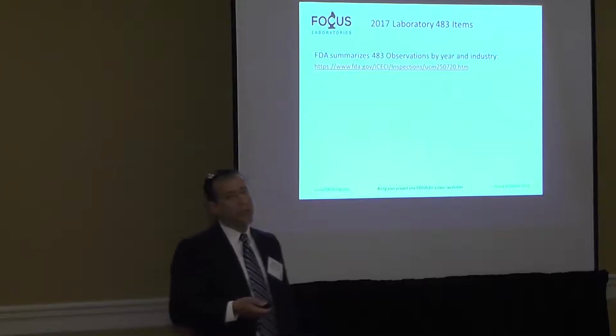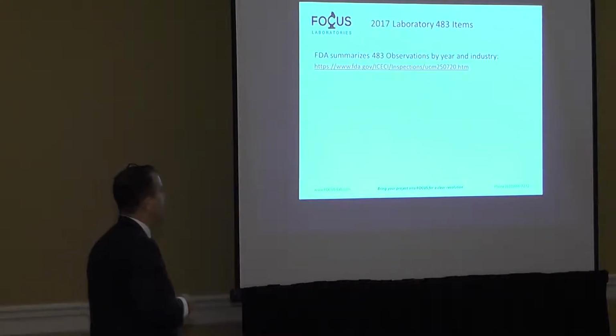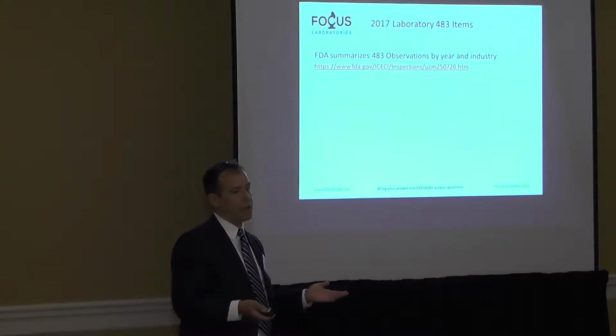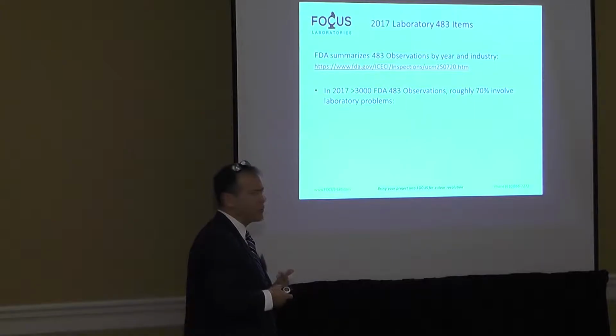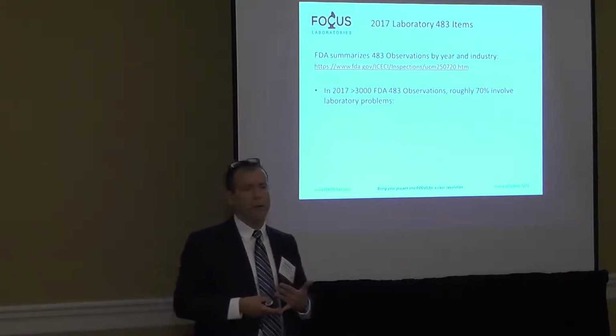In 2017 on the FDA website, there's a really interesting link. You can pull it up here. It's in the printouts that lists and summarizes the 483 observations by year and by industry. And I went and downloaded them and took a look at the summaries. Of over 3,483 observations, about 70% of them involve laboratory problems in one way or another.